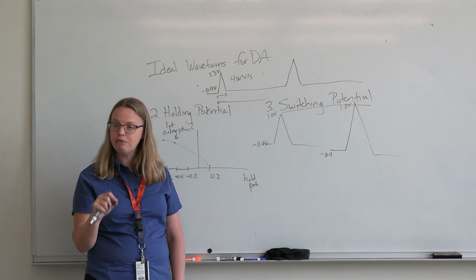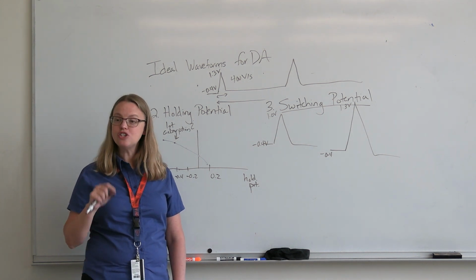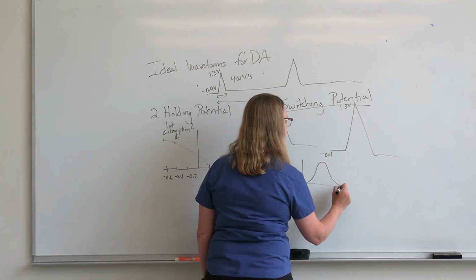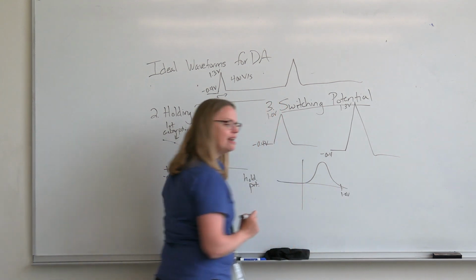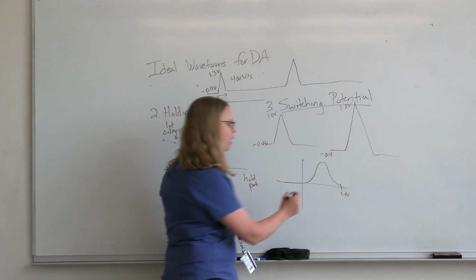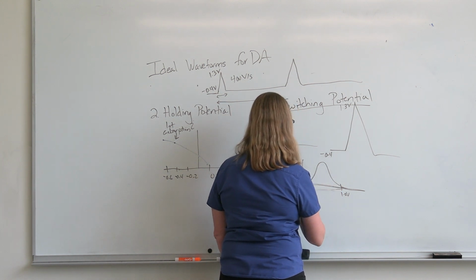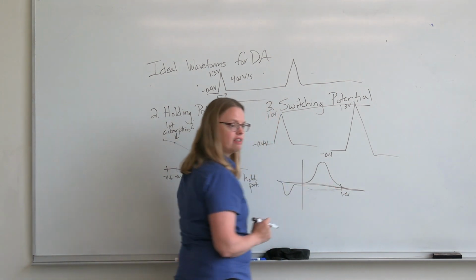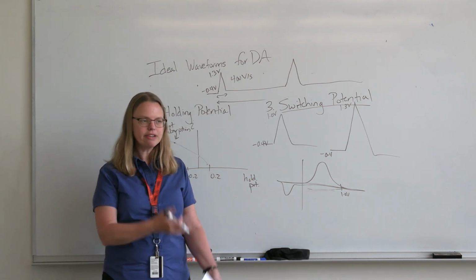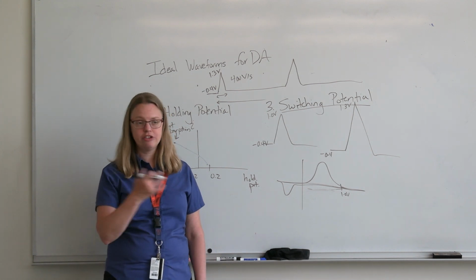It shouldn't theoretically matter. I want to get that in your brain first before I tell you why it does matter. It should not matter. If I am doing FSCV, I'm going to mark 1.0 volts here. I am done with my peak. If I am done with my peak, why am I wasting my time going out to 1.3 to come back and then do my reduction? If I have oxidized everything on the surface before that point, I'm done, right? If you look at your cyclic voltammogram, you're done by 1.0 volts. Why would you go higher? Theoretically, you should not get more electrochemistry.